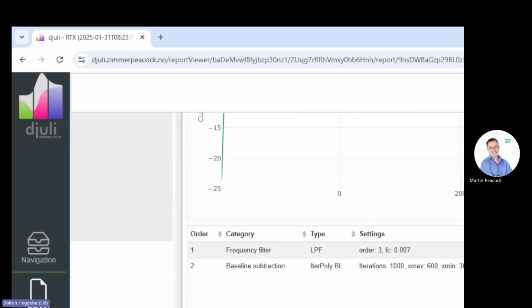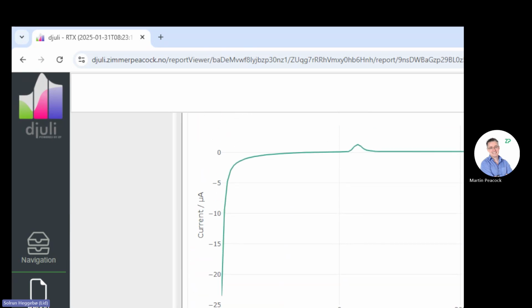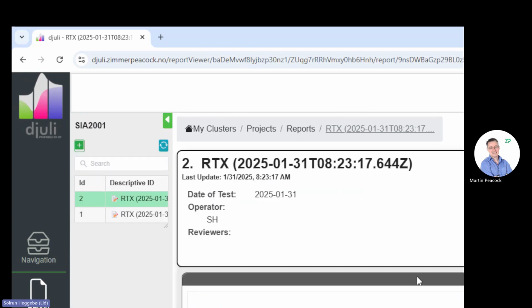If you go further down, you see all the peaks of this assay and what peak it is assessing to find out the concentration of our exact sample. And also, you can find the micromolarities down here. So if you can remember what the phone screen was telling you, you have the numbers here as well. So here's all the raw data. And if you see something is going wrong, you can see that from the raw data.